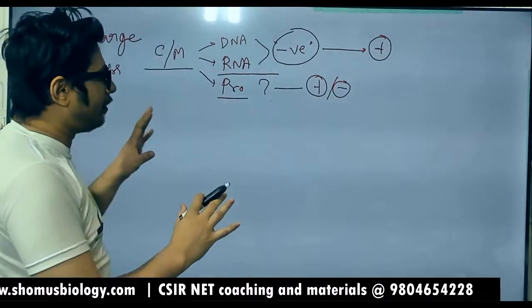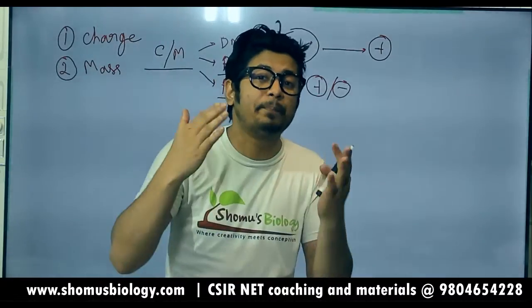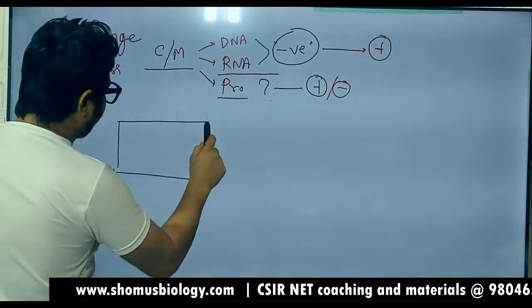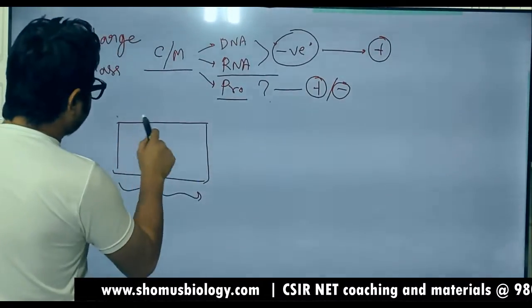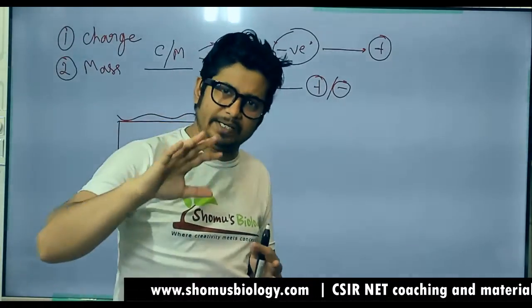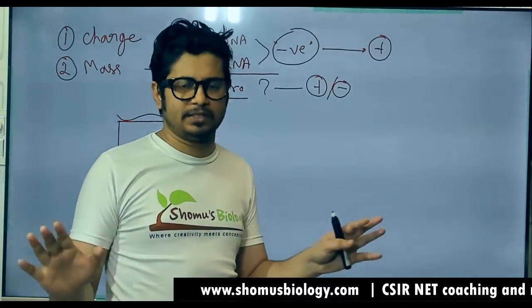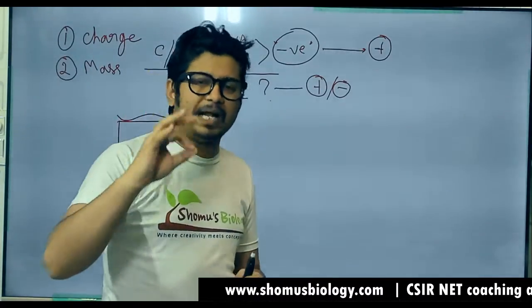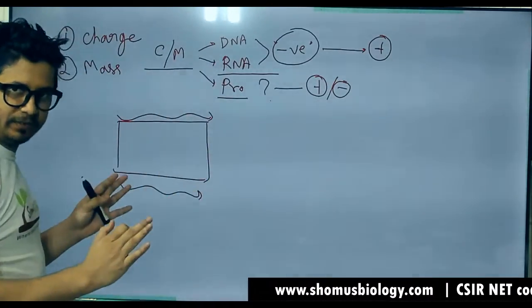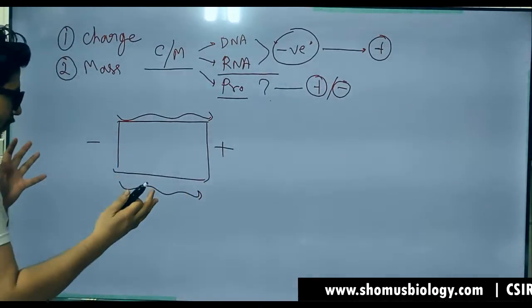Now, once you understand that in electrophoresis we always discuss charge to mass ratio, try to understand the principle of electrophoresis. The idea is that in an electric field, let's say this can be any beaker where a liquid environment is there, or it can be a solid state environment, which is agarose gel. Whether the situation is liquid or solid phase, ultimately we apply an electric field to it. How can we apply it? Let's say we have a minus here and a plus here, two electrodes, right?